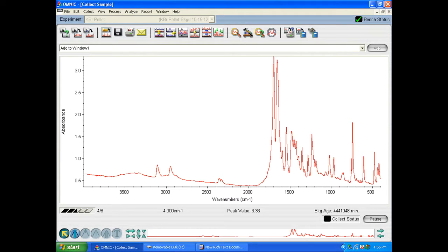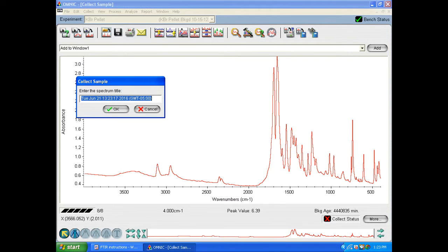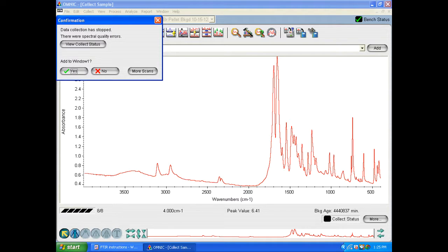So you'll see a little window here that says please prepare to collect the sample spectrum. Hit OK. And then the software will go ahead and start collecting data from the experiment. Once you have the data collected it'll ask you to name your spectrum. So in this case we'll just call it caffeine IR sample since that is what we ran. After we hit OK we'll get a window that says confirmation. Data collection has stopped. There were spectral quality errors.